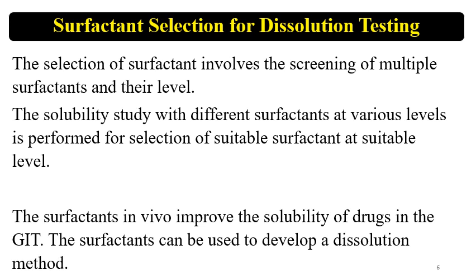So this is the reason why surfactants can be used, as the GI fluid contains surfactants in its composition, and that's why surfactants can be used in vitro also for dissolution testing.